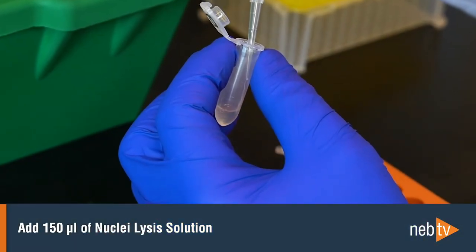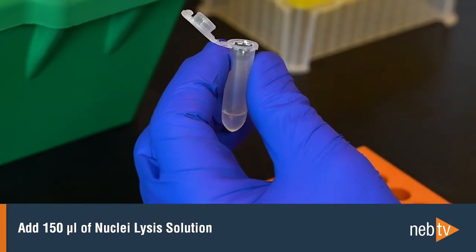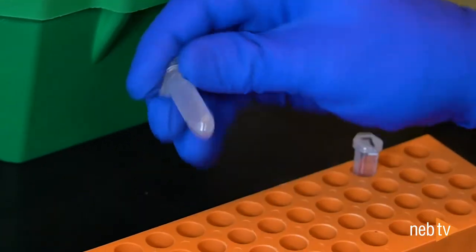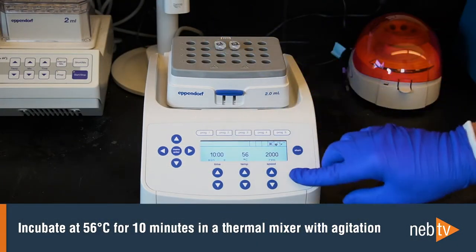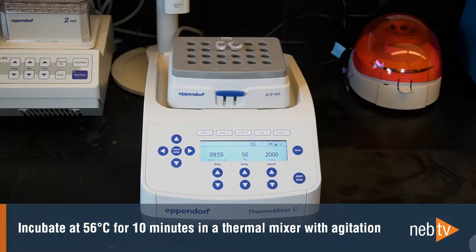Next, add 150 microliters of nuclei lysis solution and invert 10 times to mix. Avoid introducing air bubbles and do not vortex or pipette. In this step, the nuclei are lysed, releasing the genomic DNA. Incubate at 56 degrees for 10 minutes in a thermal mixer with agitation at the desired speed to control the shearing and tune the size of the gDNA.